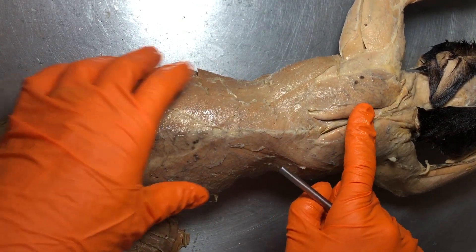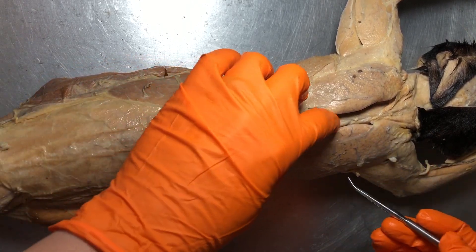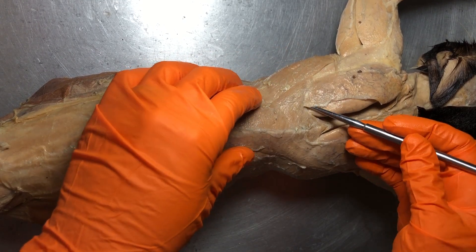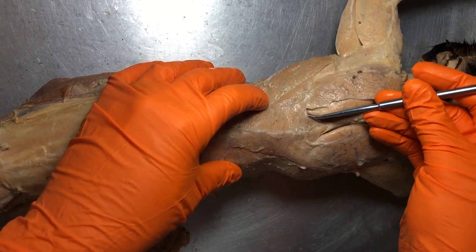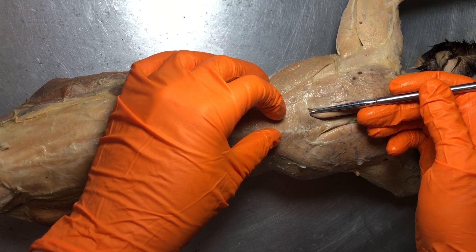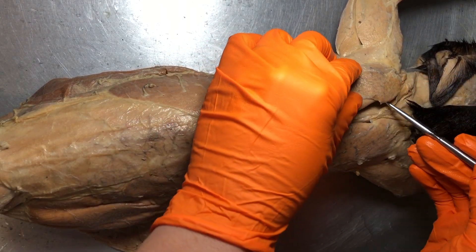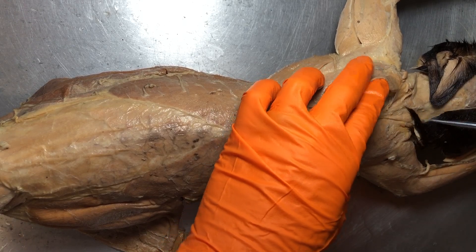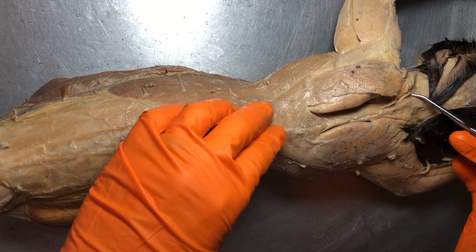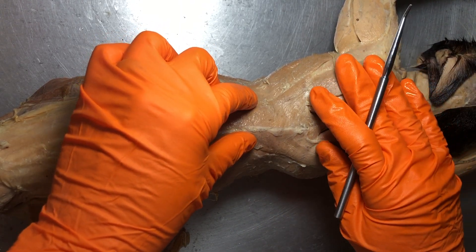Anterior to that — remember anterior on a kitty cat goes toward the head — we have the trapezius. The trapezius has three parts to it, just like it does in a human. For my students, you just have to know trapezius. But if you're curious: the more posterior part is the spinotrapezius, then we have the acromiotrapezius in the mid part, and then the clavotrapezius up here. This whole area is the trapezius — a rhomboid or kite-shaped muscle and a major back muscle.